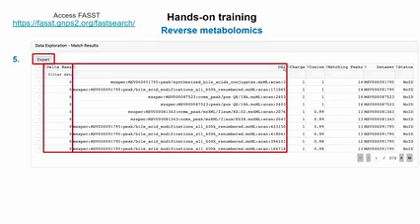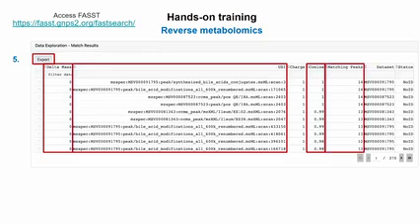It is matched against all the data sets and all the MS spectra in the given USI, and you will have a cosine similarity score. When you see a cosine similarity score of 1, that means it's a perfect match, and depending upon how many matching peaks there are, the cosine score can change accordingly.